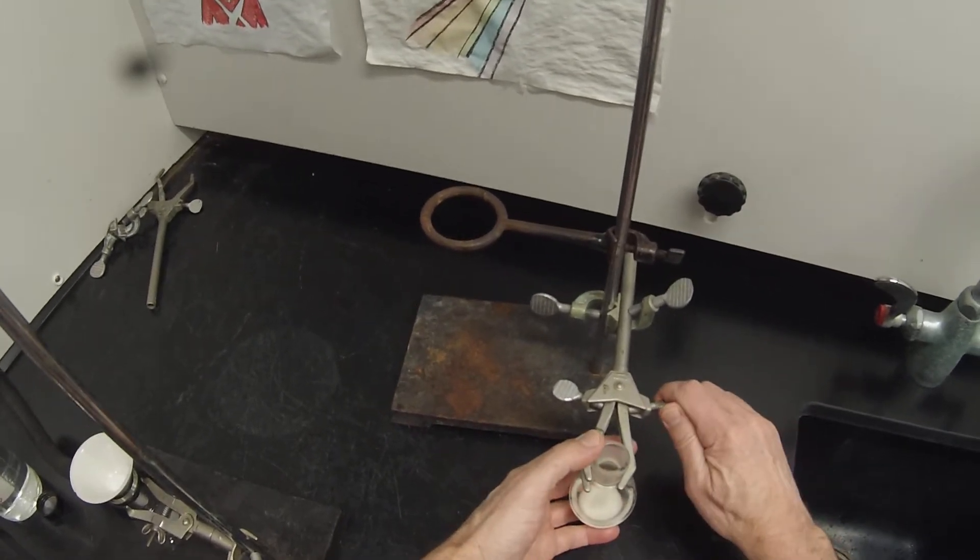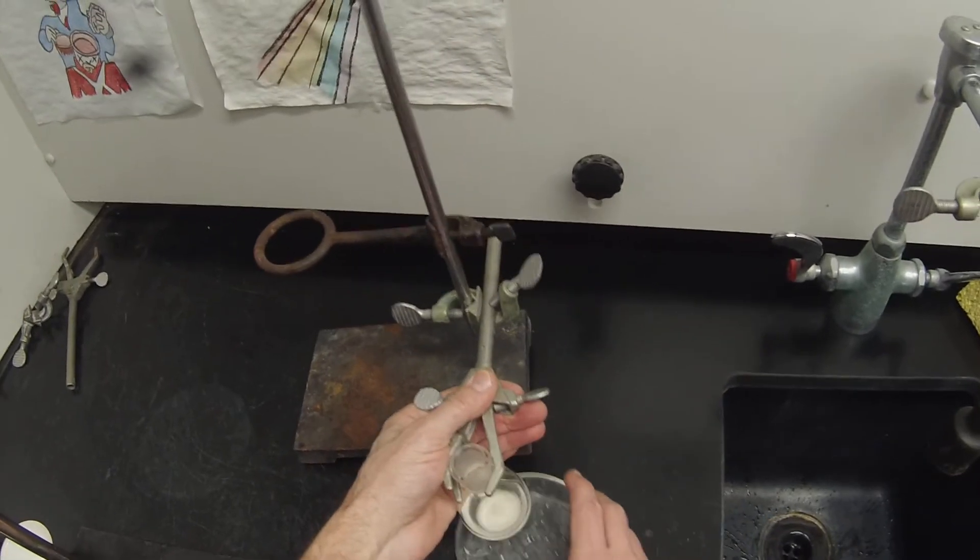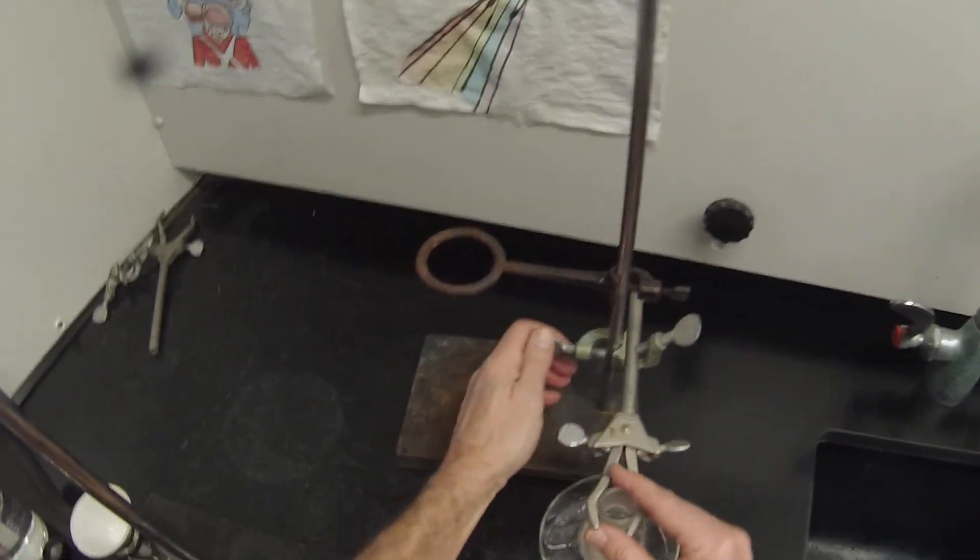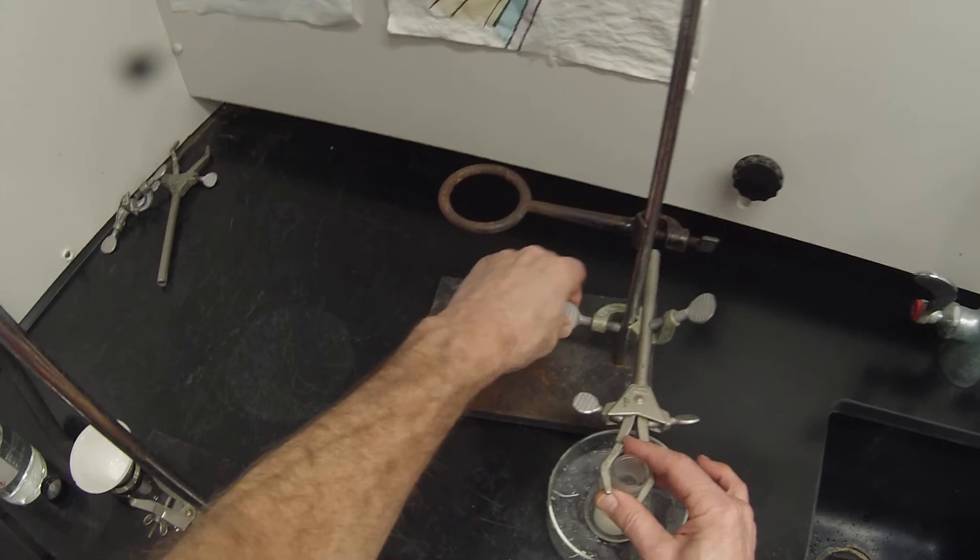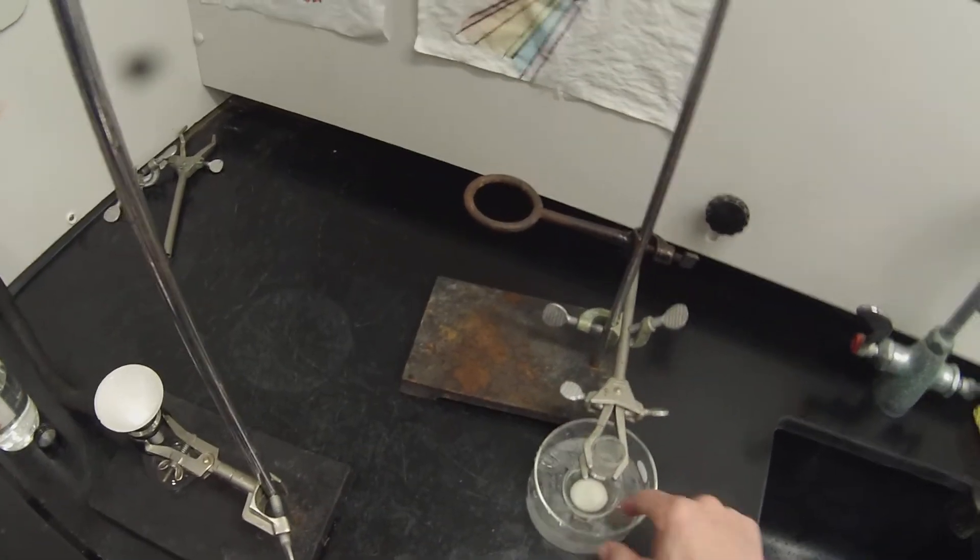Three-jawed clamps aren't ideal for this flask, but I just want to get it stable enough that it's not going to fall out of there. So we'll let that cool a little bit.